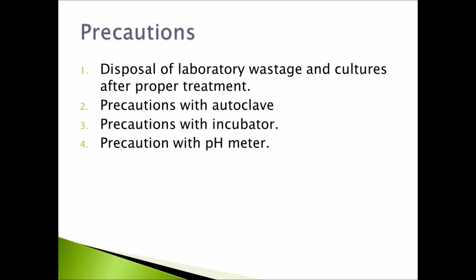Heat-sensitive substances should not be sterilized by autoclaving, and it is important to mention that nowadays checking of complete autoclaving is possible by using strips that contain a red solution which turns green at 115 degrees C if kept for 25 minutes.